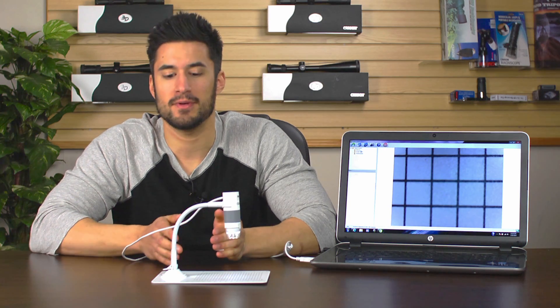Hey what's up guys, this is Doug from Carson Optical and today I have with me a digital microscope called the eFlex. With this you can look at microscopic images or even take pictures and video. There's a lot I like about this product so let's get started.